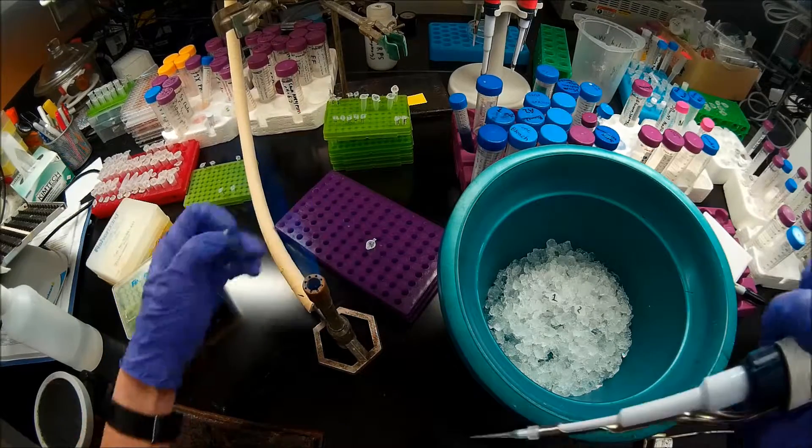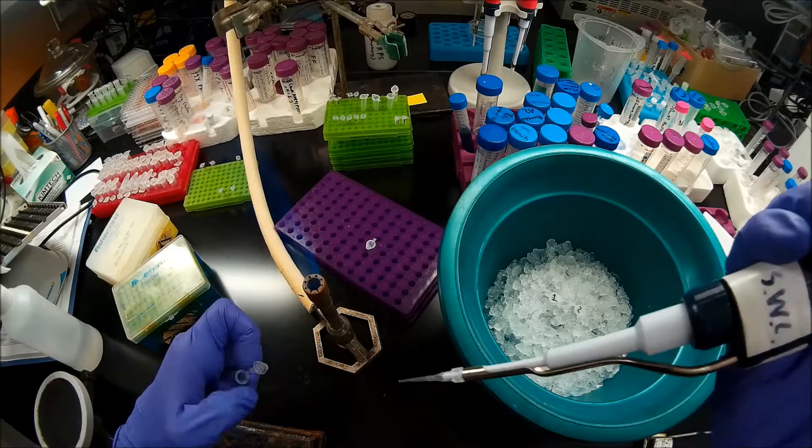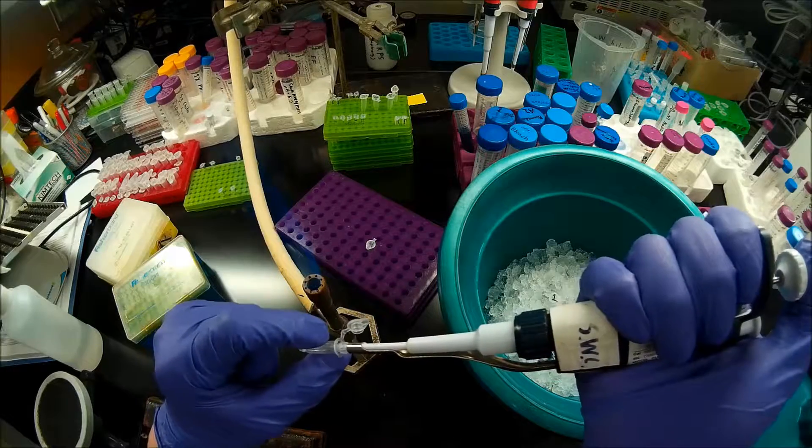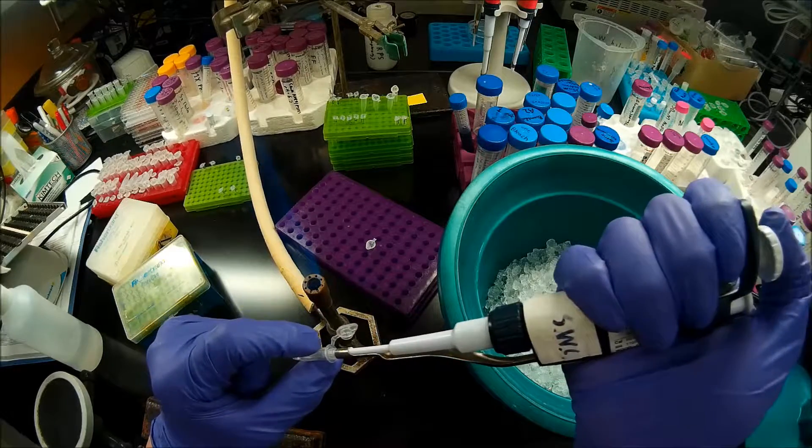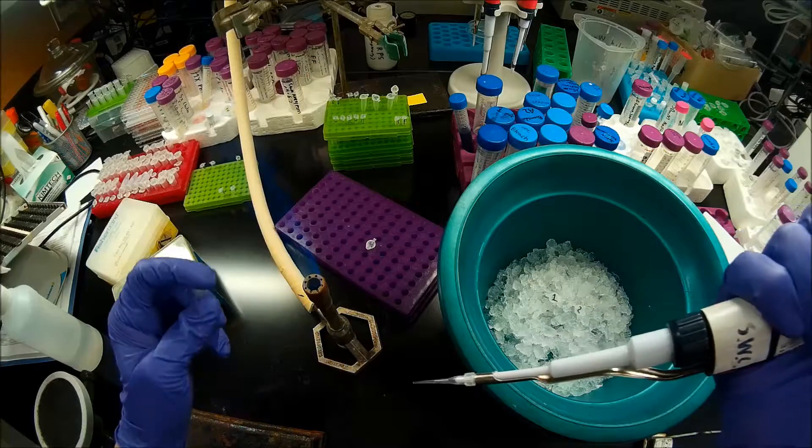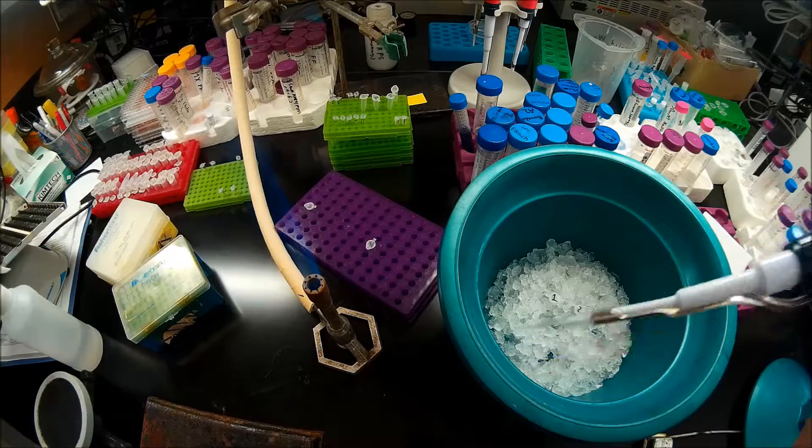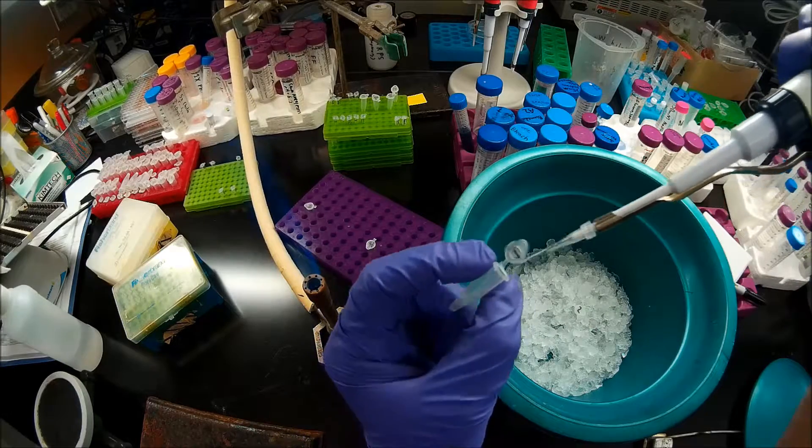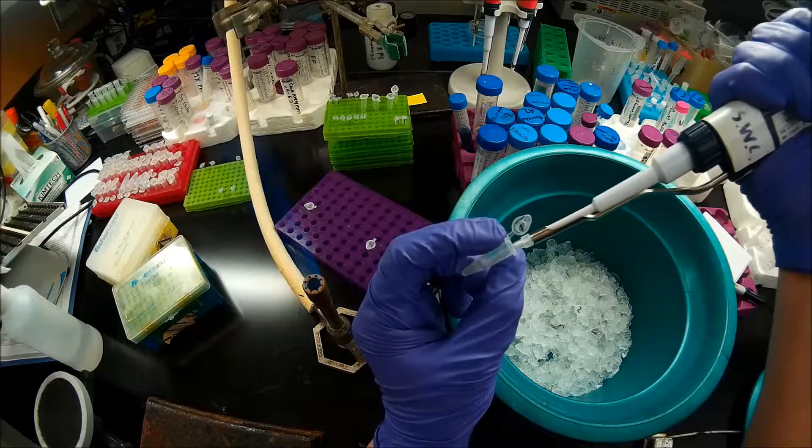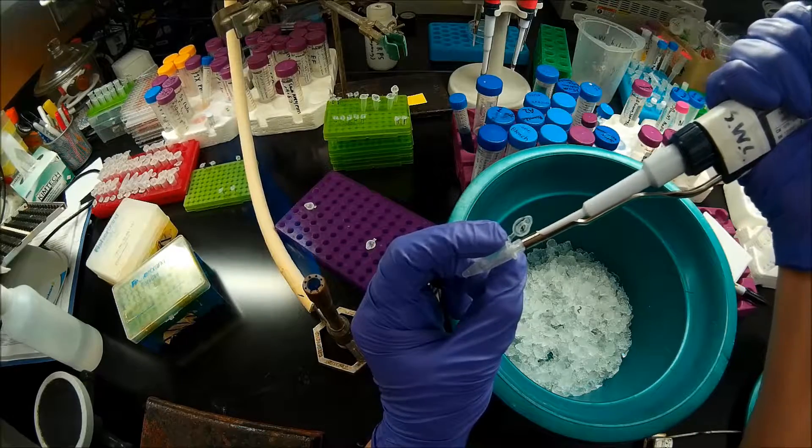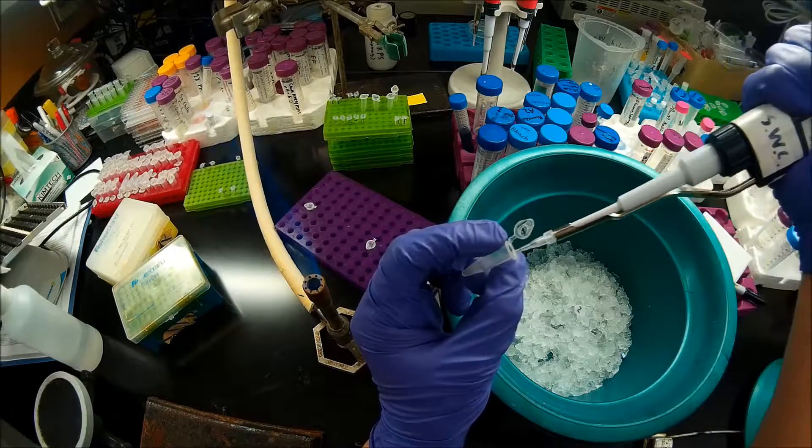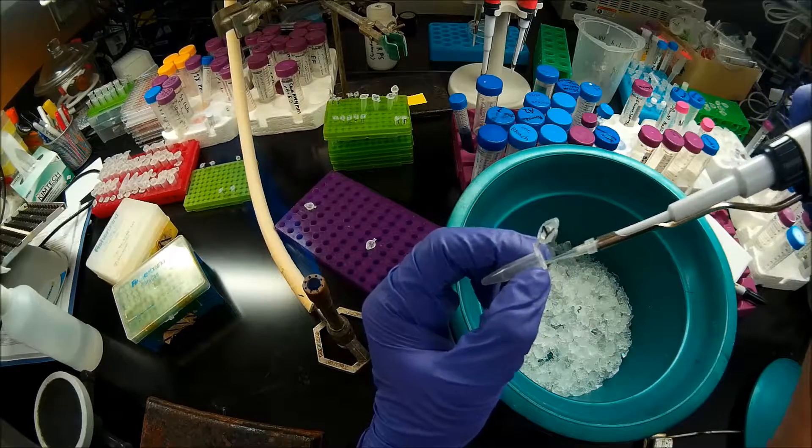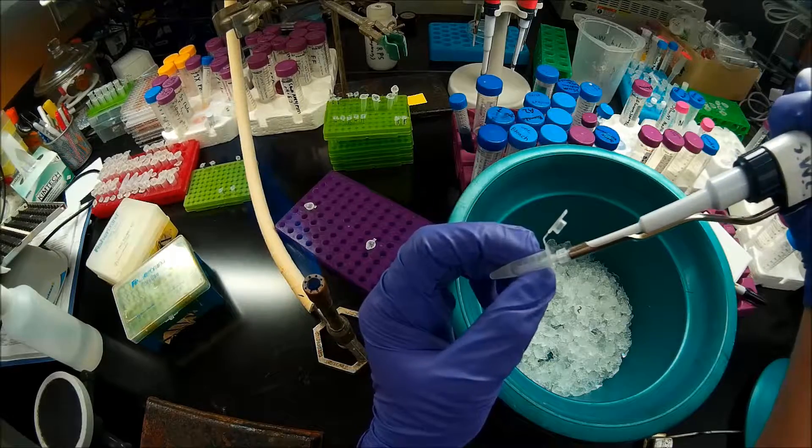These cells have a competency of about 10 to the 6th colony forming units per microgram. So I'm taking my ligation mixture. I'm actually just going to pipette up and down a couple times. And then I'm going to pipette that directly into the competent cells. And you'll note that I'm using my pipette to blow bubbles from the bottom of the competent cell aliquot. That's a really gentle way of mixing.